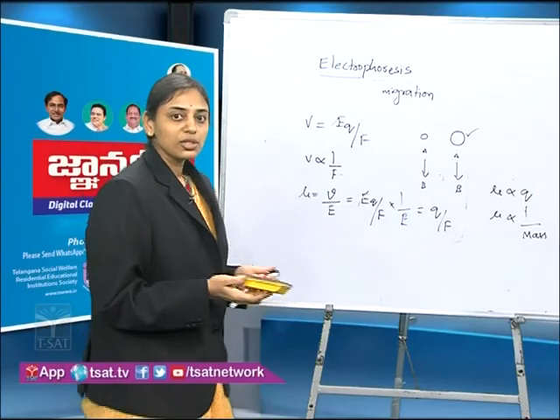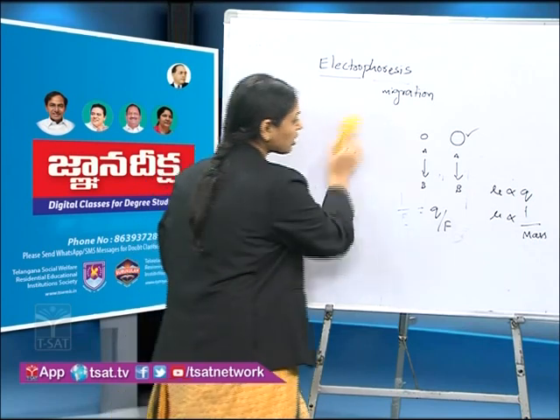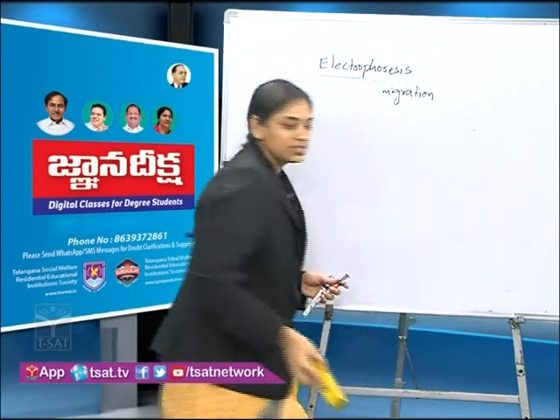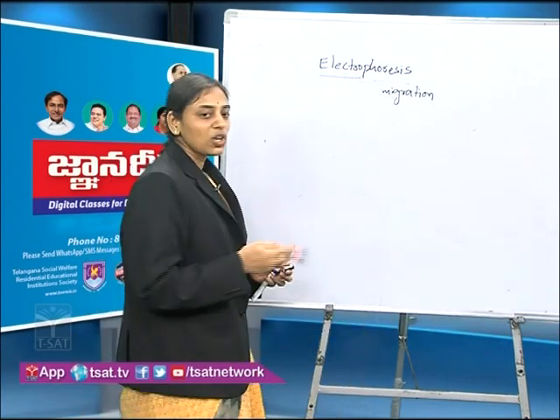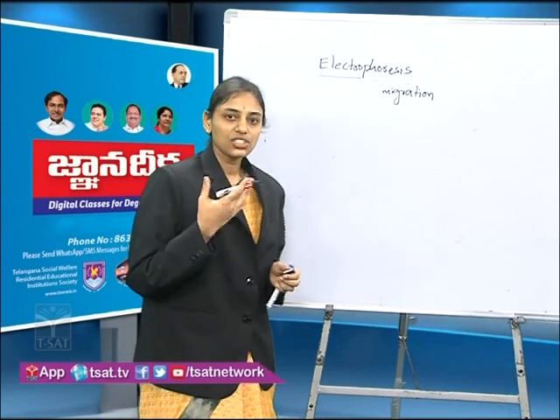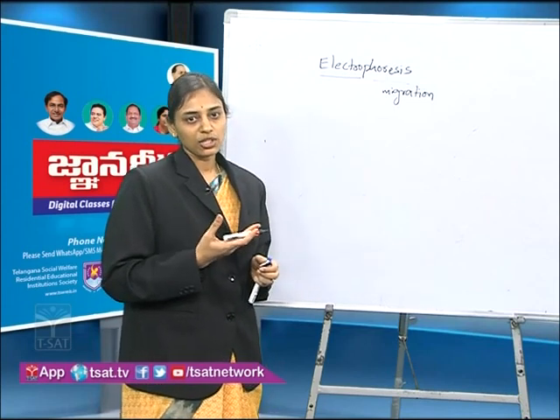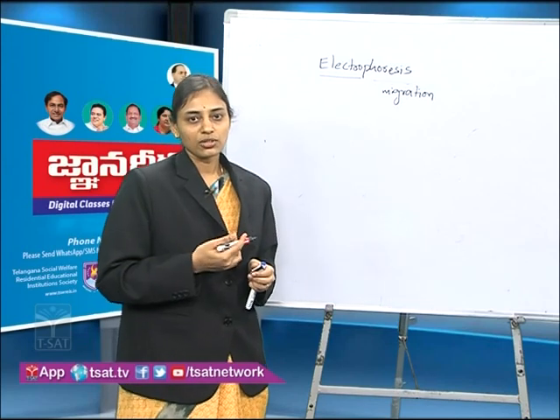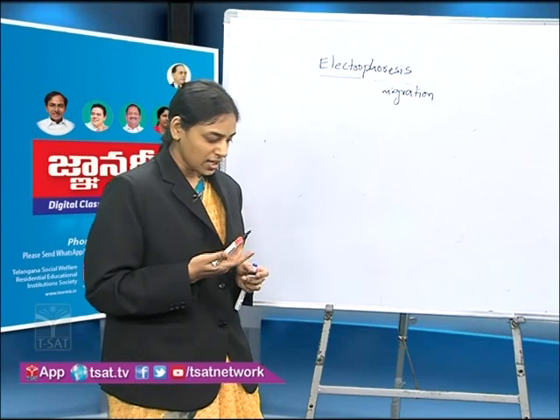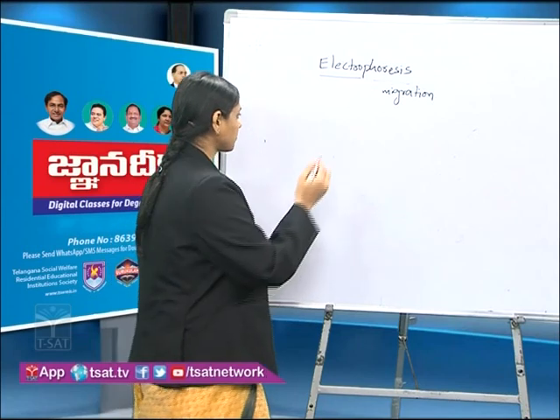So, what are the molecules which we are talking about here? And do the molecules carry charge on their surface? Let us see these questions. The molecules which we are going to separate are of various kinds, for example, drugs, steroids and biomolecules. We are interested in biomolecule separation. What are biomolecules? Molecules which are in the living system are called biomolecules. The major types are carbohydrates, lipids, nucleic acids and proteins.